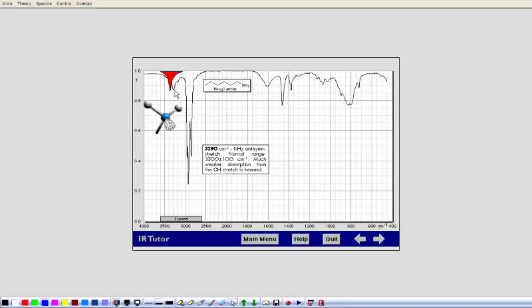So when you see a little doublet pair like you see here, that indicates that you have an NH2. One of the reasons I gave you all these example spectra is that you have a stack of spectra that you're going to match to compounds for homework. It might be helpful to look at these particular shapes, because if you find a spectrum with that little doublet pair, then it is most likely the NH2.